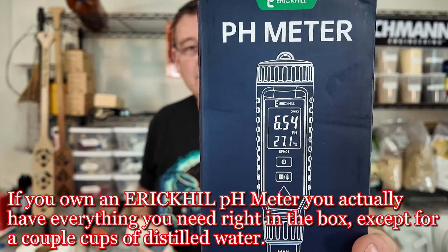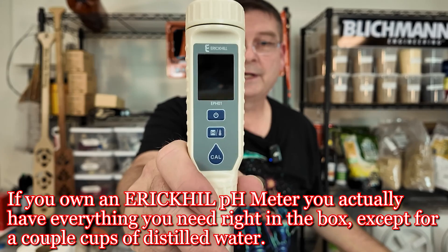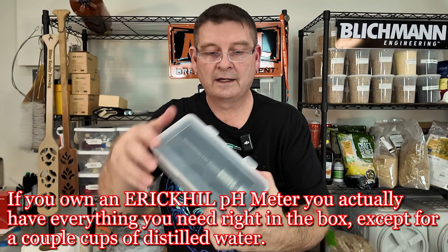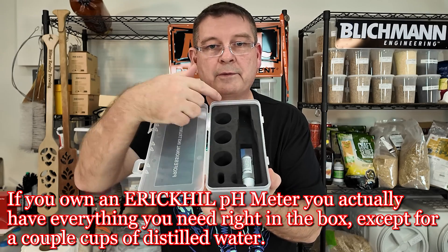I know some of you out there want to kill me because you've been like, I need you to do the calibration. I want to make sure I'm doing this right. It's not that hard, but I'm gonna tell you what you need. First of all, you're gonna need your pH meter from Eric Hill, of course, which is right here. Make sure your batteries are installed. Open this, take out the three solutions.